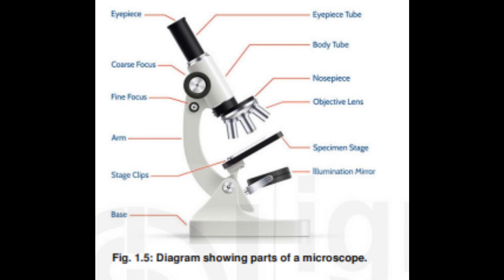Alternatively, when the image of the source is focused on the condenser, followed by the objective of the microscope, it is referred to as Köhler illumination. It is useful in getting sharp images of magnification 400x and above. For a microscope with a power of 1000x or above, a condenser lens with an NA of 1.25 or greater is needed.